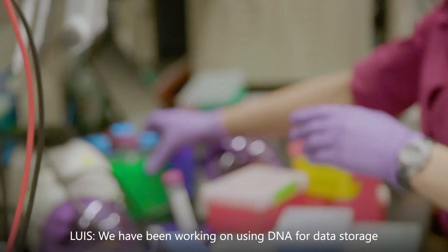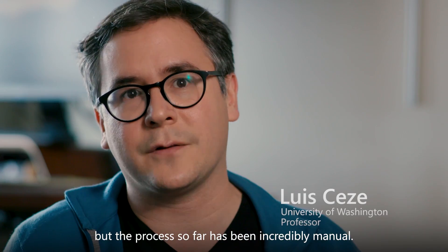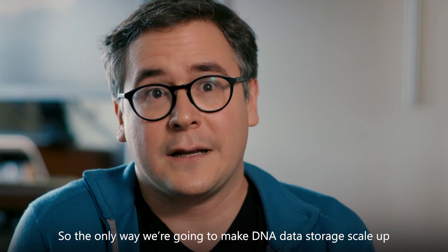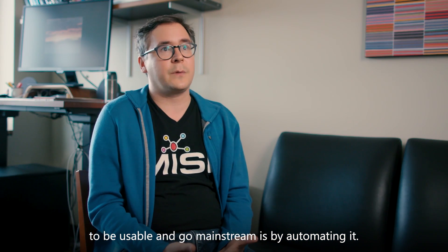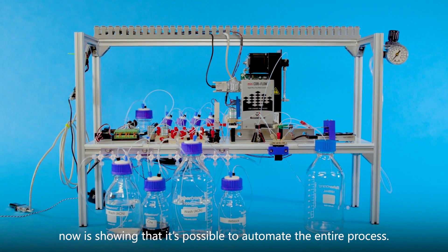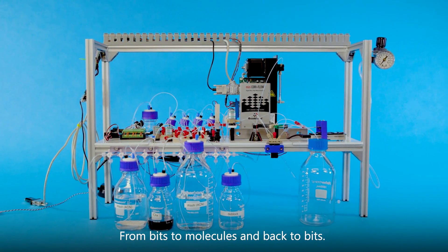We have been working on using DNA for data storage for several years now, but the process so far has been incredibly manual. There are literally people moving around with pipettes in their hands. The only way we're going to make DNA data storage scale up and go mainstream is by automating it. What we've done with this project is show that it's possible to automate the entire process from bits to molecules and back to bits.